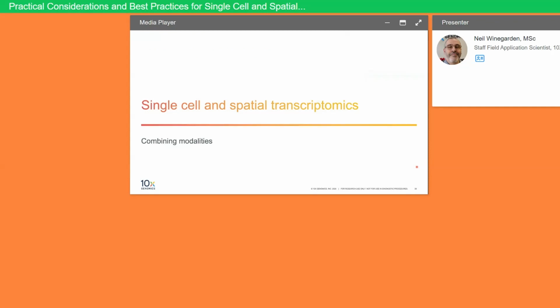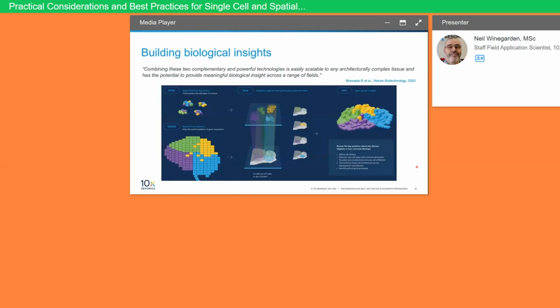I'd like to close out this presentation by briefly talking about informatic approaches to integrating single cell or single nuclei and spatial transcriptomic data. Recently, there have been a number of publications that bring together single cell and spatial transcriptomic information. This sort of integrated analysis provides even greater understanding of the complex biology underlying processes within tissues.